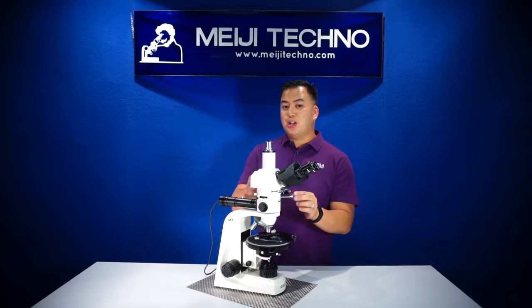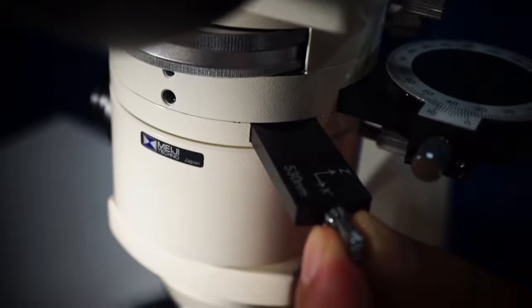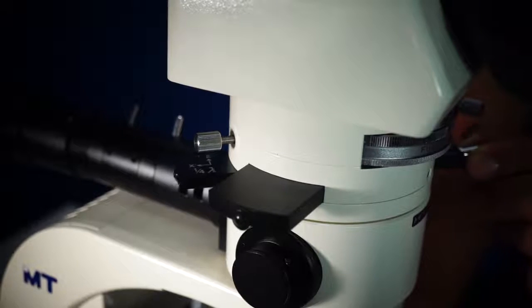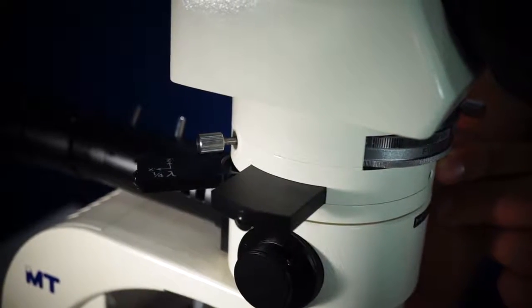The good thing about this model is that the first-order red and the quarter-wave plate are in one slider. The middle position is the bright field position, and it has a locking pin preventing misplacement of the plate — it's always going to be there.